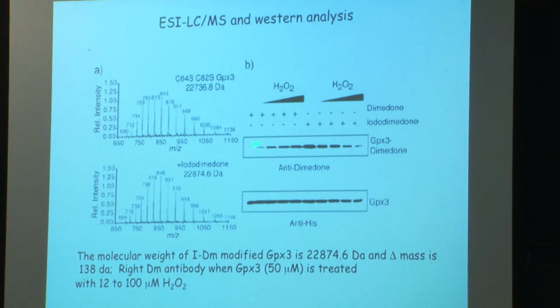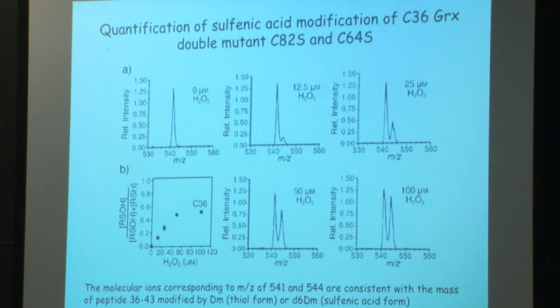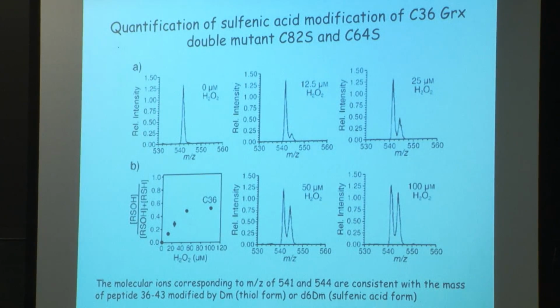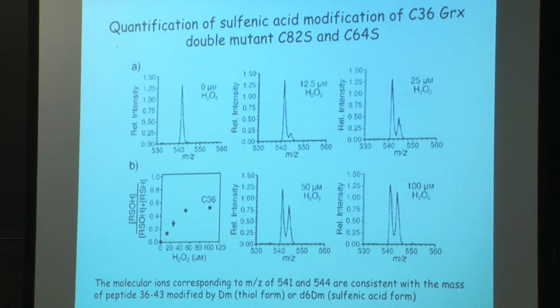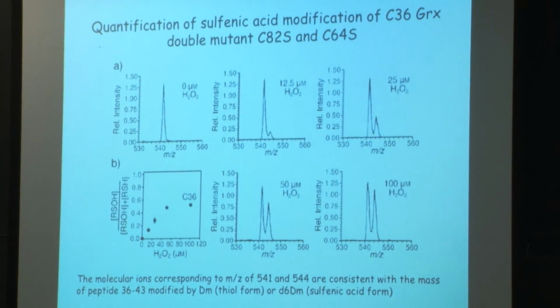Okay, but this then takes you to the next set of data here, which you could have gotten in some form by looking at that data. Now what you're looking at is a ratio of what's sulfenylated versus what's a sulfhydryl plus sulfenylated.